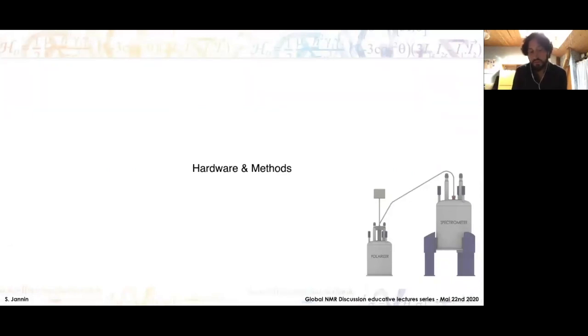But if you pulse with a very small angle, you can do many pulses in the liquid state. But if your interscan delay is too short, then you don't have enough acquisition time, so your resolution gets lower. So the standard is to leave at least a second between each pulse to leave enough time for acquisition and to have a decent resolution in the liquid state. That's the standard way of doing liquid state acquisition.